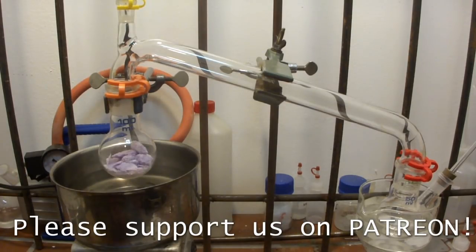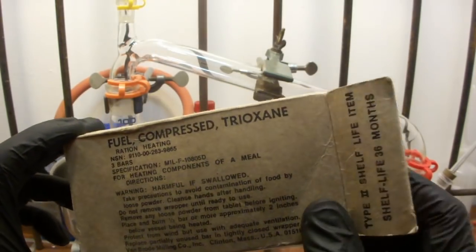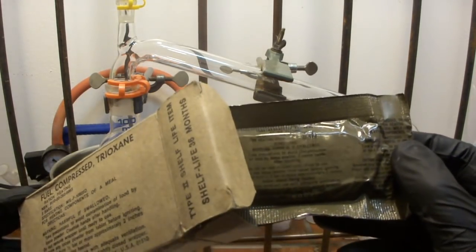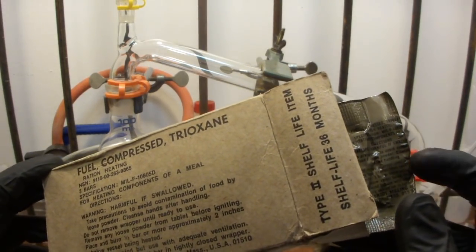Today we are going to show you how you can extract and purify trioxane from these packages that contain mostly trioxane and some other ingredients and that are used as fire starters or to heat meals.